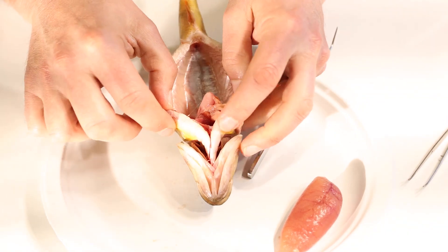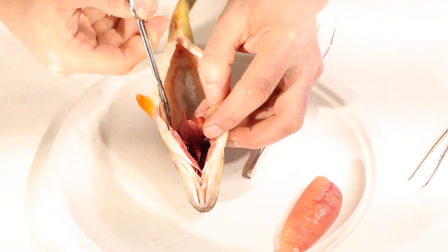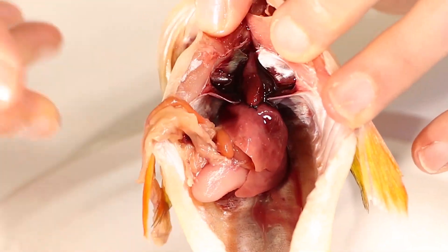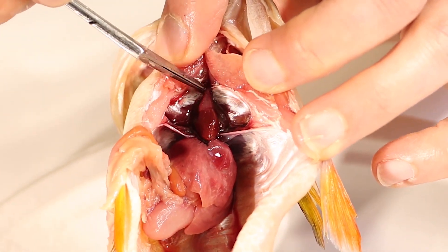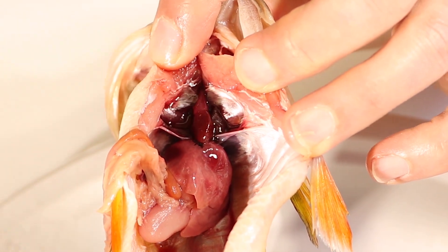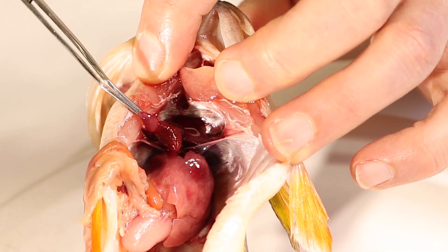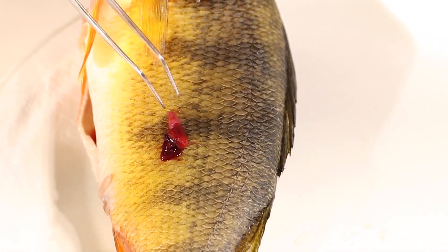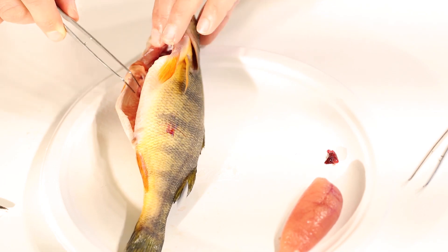We'll set those eggs aside in one big egg mass, and move our attention up closer to the front of the perch. I need to open this up a bit more because way up here between the gills — not the easiest thing to see — there's a little red lump, shaped almost like a little triangle. That is the fish's heart. The heart is way up here, with a chamber on top and a chamber on the bottom. If we grab it carefully by the arteries and veins at the top, we should be able to take the heart right out. There it is — we'll set the fish's heart off to the side.